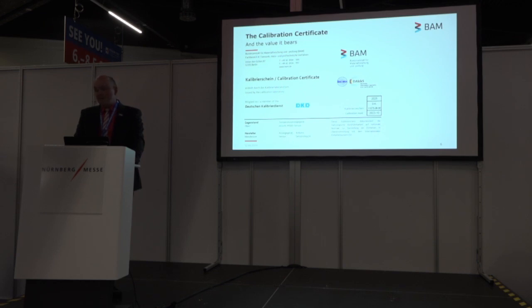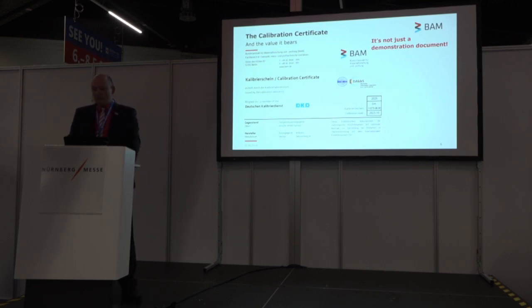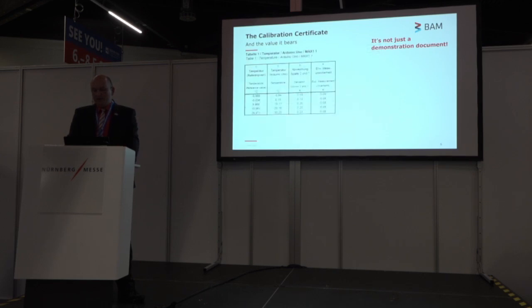The most important message here, that a calibration certificate is not just a demonstration document. It contains a lot of valuable data, and you paid for this data. You paid for the calibration, and the calibration lab puts a lot of effort into getting this data, and so you should use the data properly in order to take out the advantages of it. And I want to explain this a little bit more in detail.